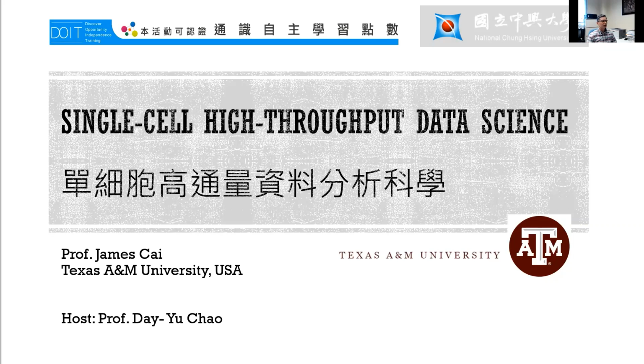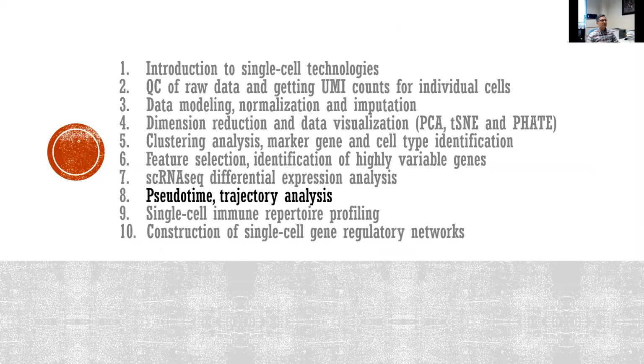Hello, welcome to our lecture number 8 on single-cell high-throughput data science. Today, we are going to talk about pseudotime and trajectory analysis. And I will explain what they are and how this analysis can be done computationally based on the single-cell RNA-seq data.